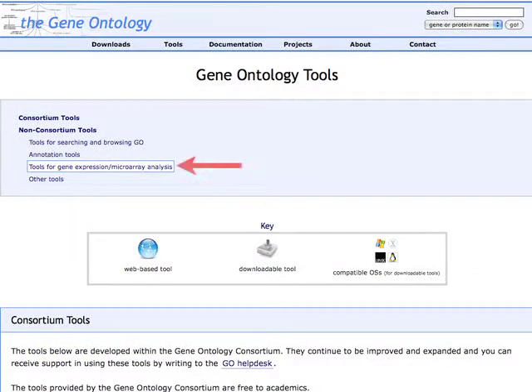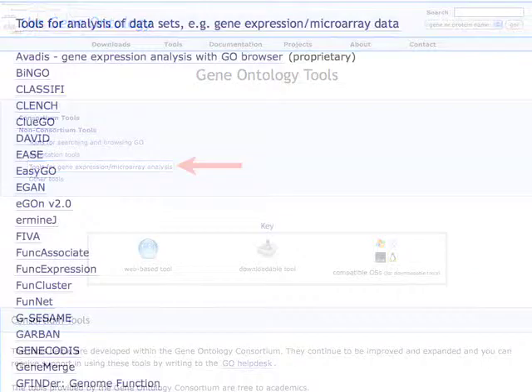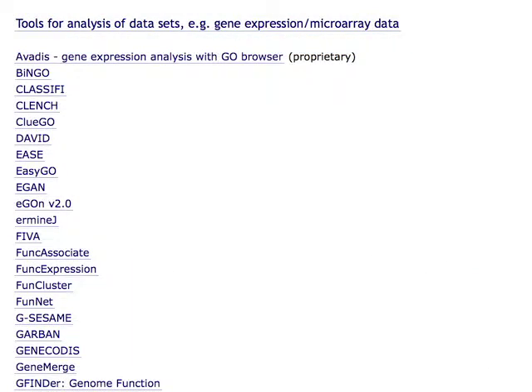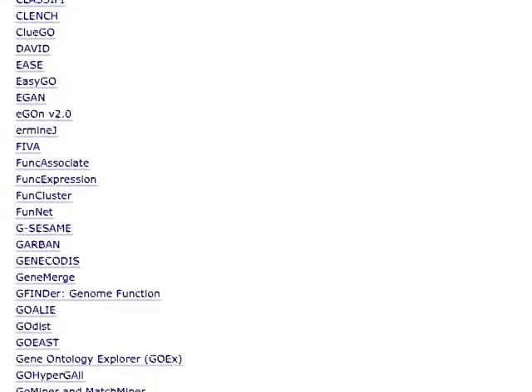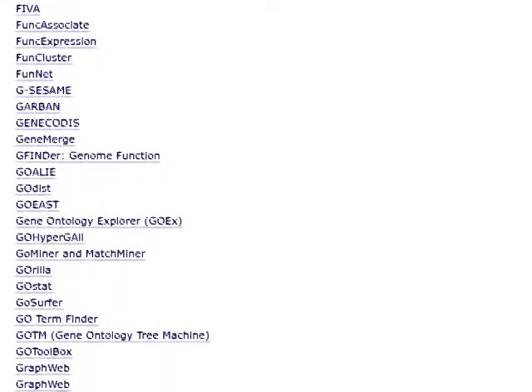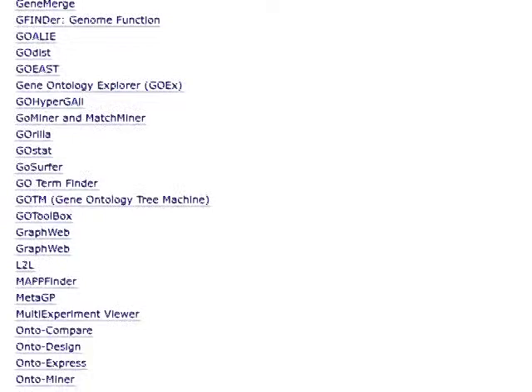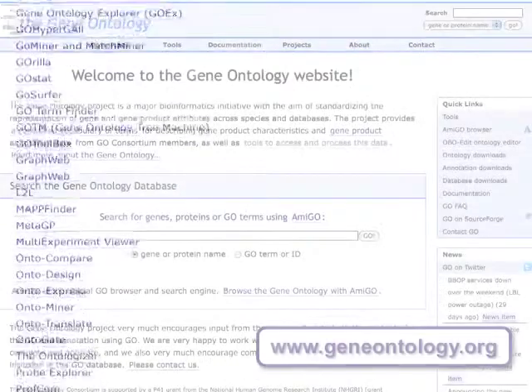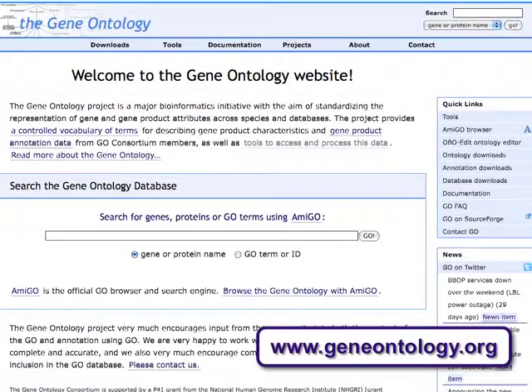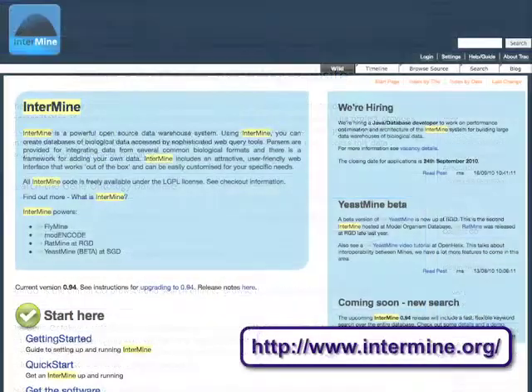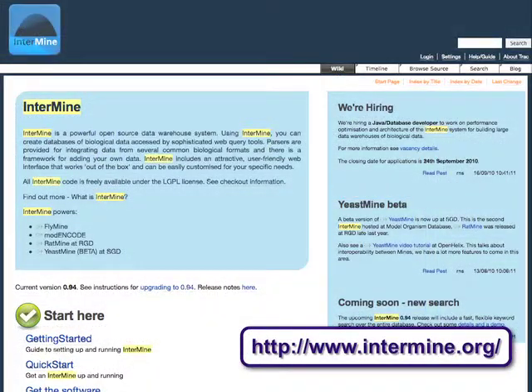There are many tools available both on the web and as downloadable programs which do ontology term enrichment. The Gene Ontology Consortium website lists many such programs that are available for public use. We will only talk about a single tool, but the basic concepts can also be applied to other applications. The tool that we will be examining is the Intermine ontology enrichment widgets.